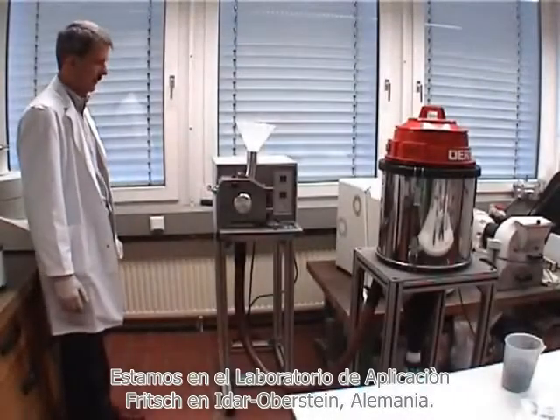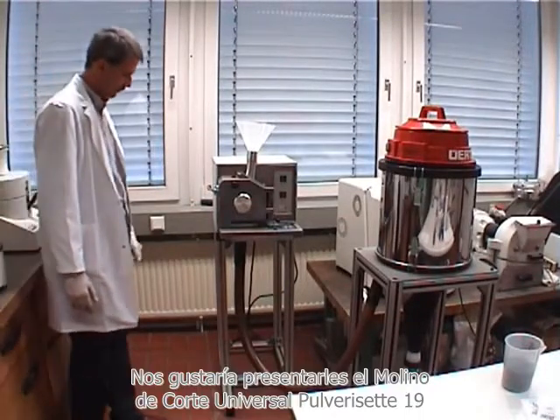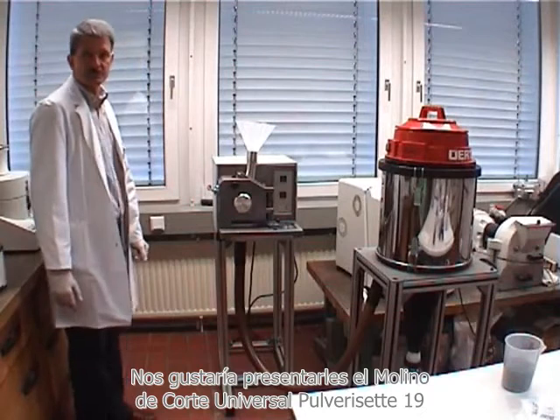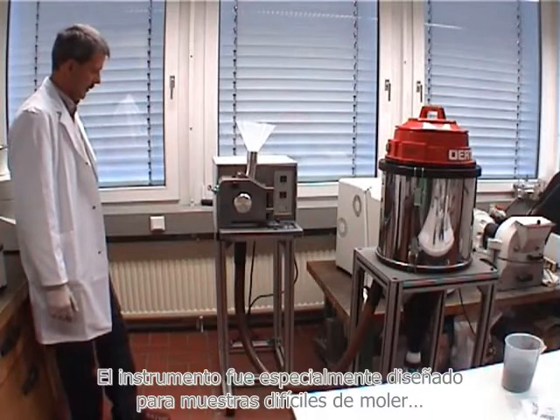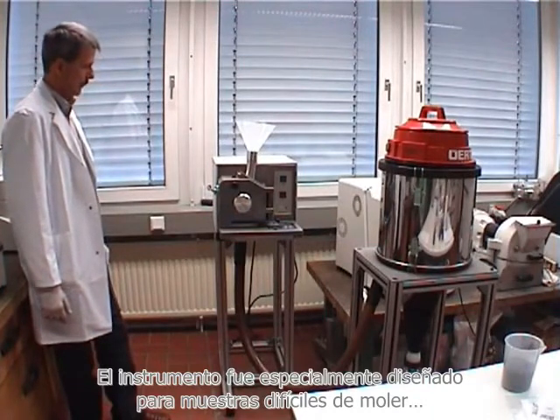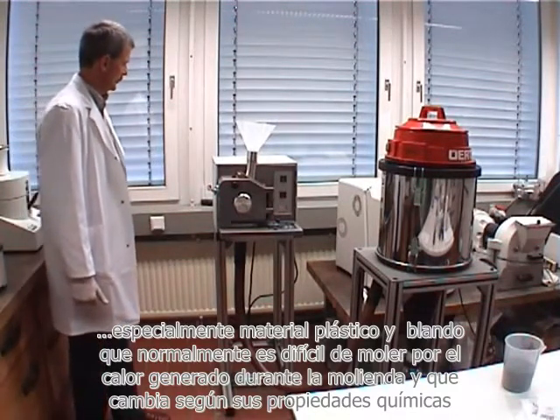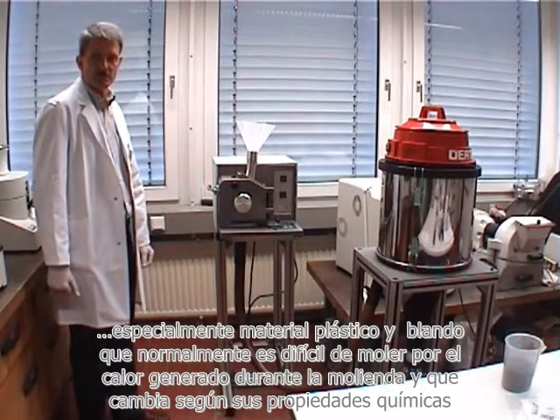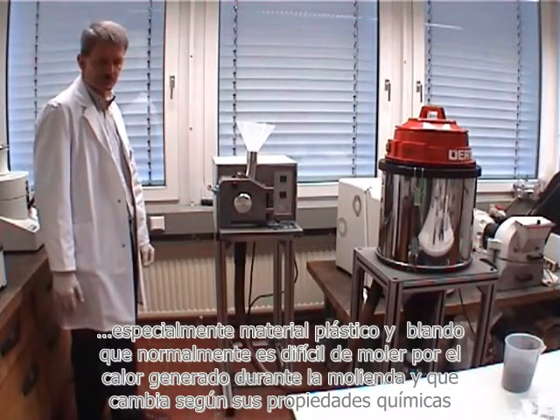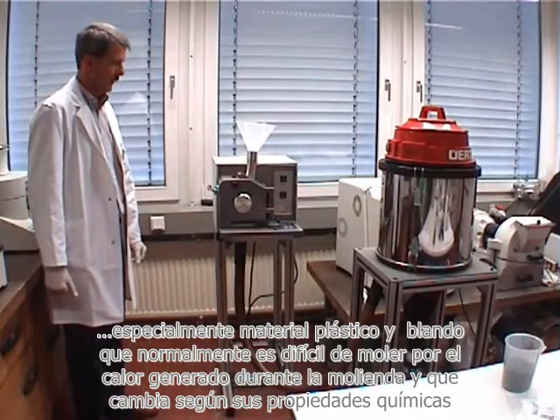We are in the Fritsch Application Laboratory in Idar-Oberstein in Germany. We would like to present you the Pulverisette 19 Universal Cutting Mill. That instrument was especially developed for difficult to grind samples, especially plastic materials and soft materials, which normally are difficult to grind because they heat up during the grinding and there may be changes in the chemical properties.